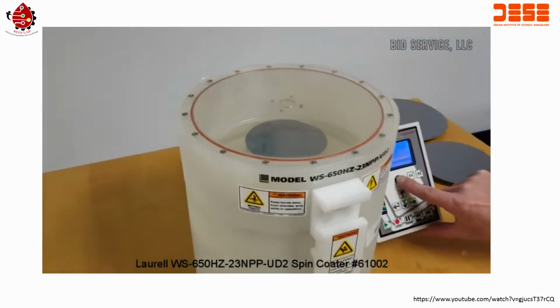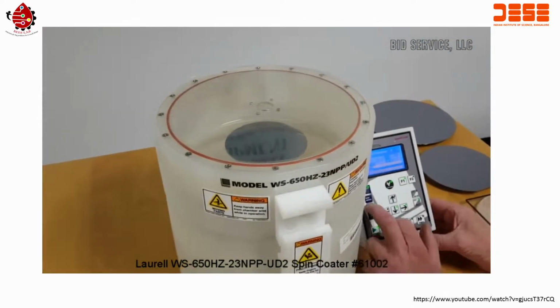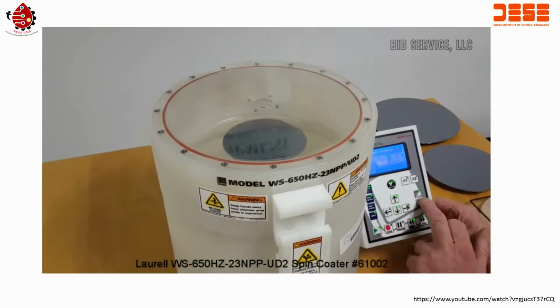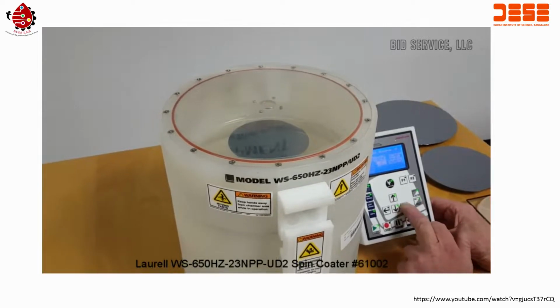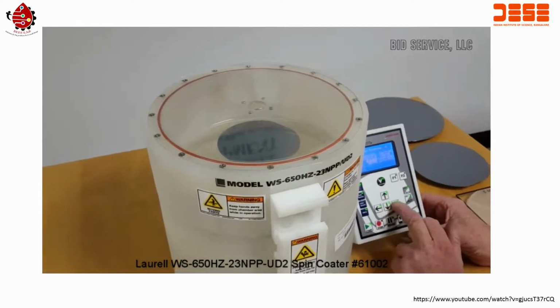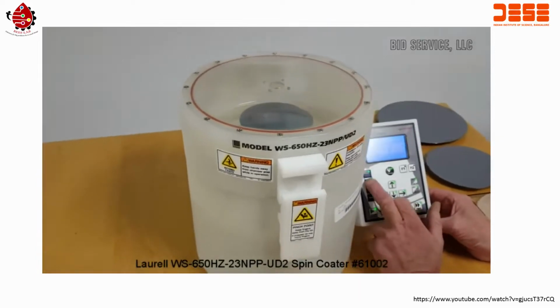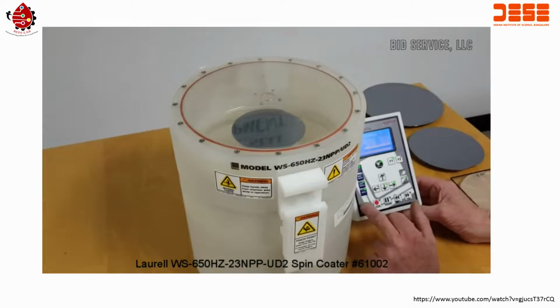Apply a vacuum. And we will also edit that speed down to 6,000 RPM. And here we go.